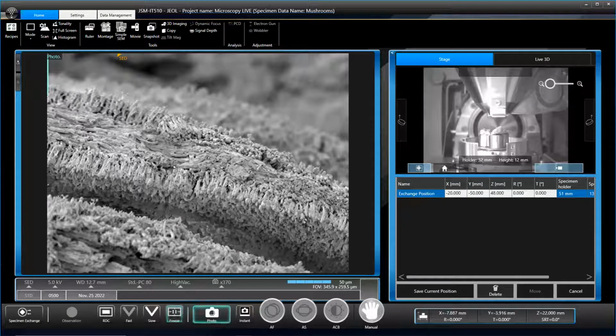That even looks like a cross section to me, or the very tip of the gill. Definitely. It kind of looks like they've been flattened a little bit, doesn't it? But that's a huge surface area, so you can see how when they produce billions of spores, that'll do it. Quite cool though.